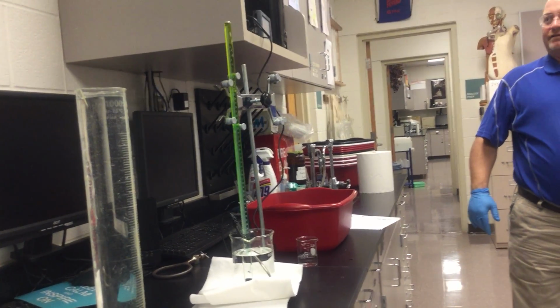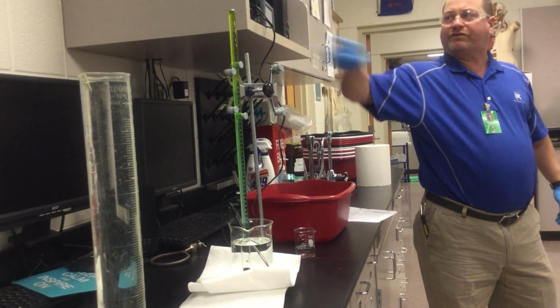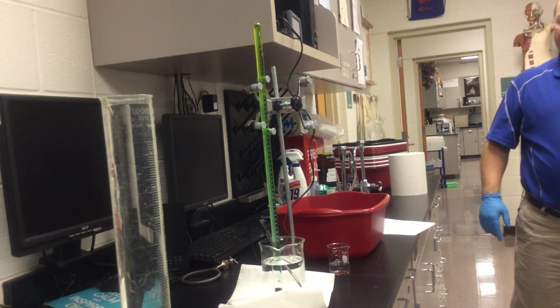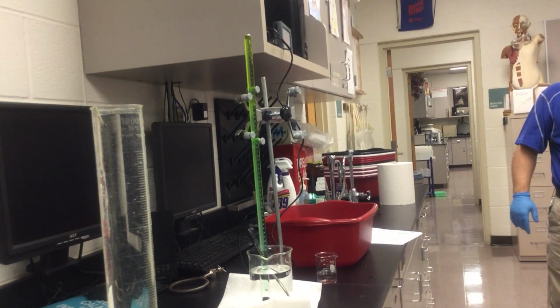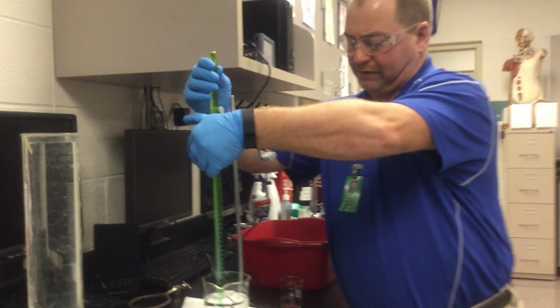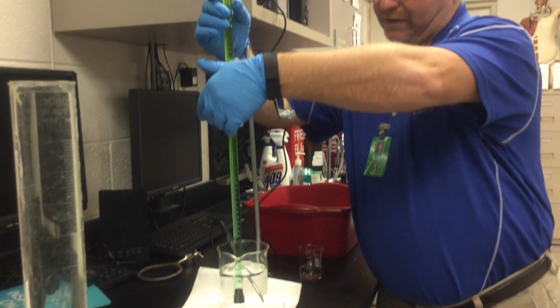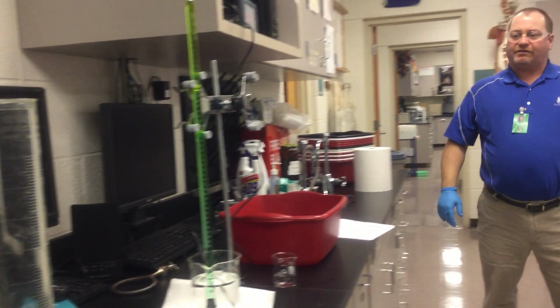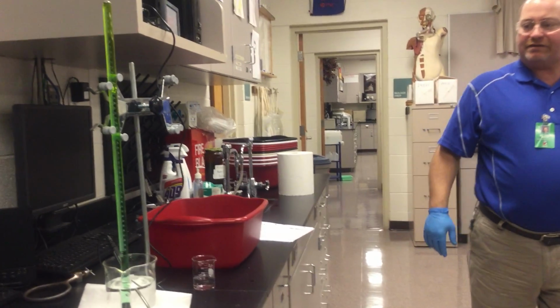So we can see the acid moving down. Note our temperature, 17.9 degrees Celsius right now. Okay. I can see that the green, I'm going to lift this up just a tad bit to make sure that that is not sitting on the bottom. But I can see that the green's getting down to where the magnesium is.